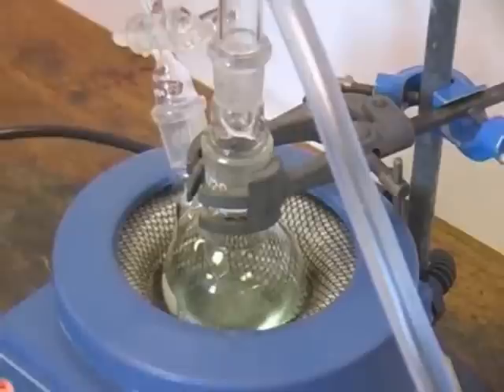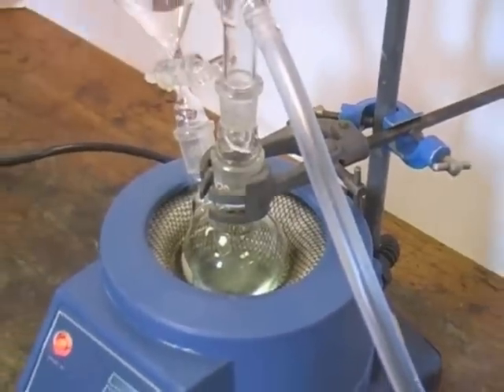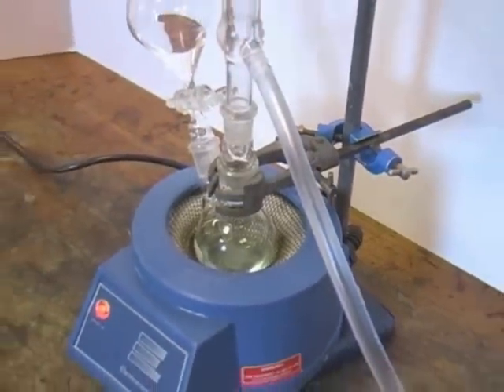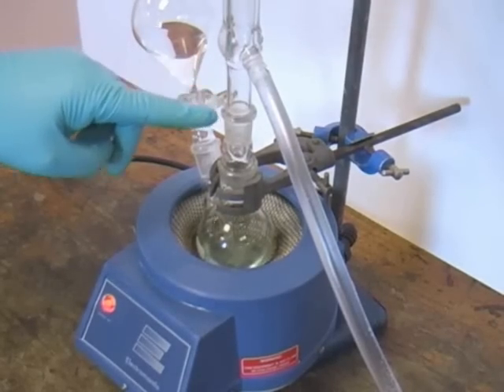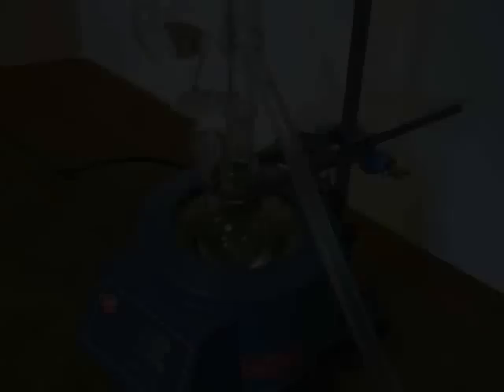Here you can see the reaction mixture in a state of reflux. As the solvent boils, its vapour condenses in the condenser before dripping back into the round-bottom flask. This allows us to keep the temperature of the reaction high without losing solvent vapour.